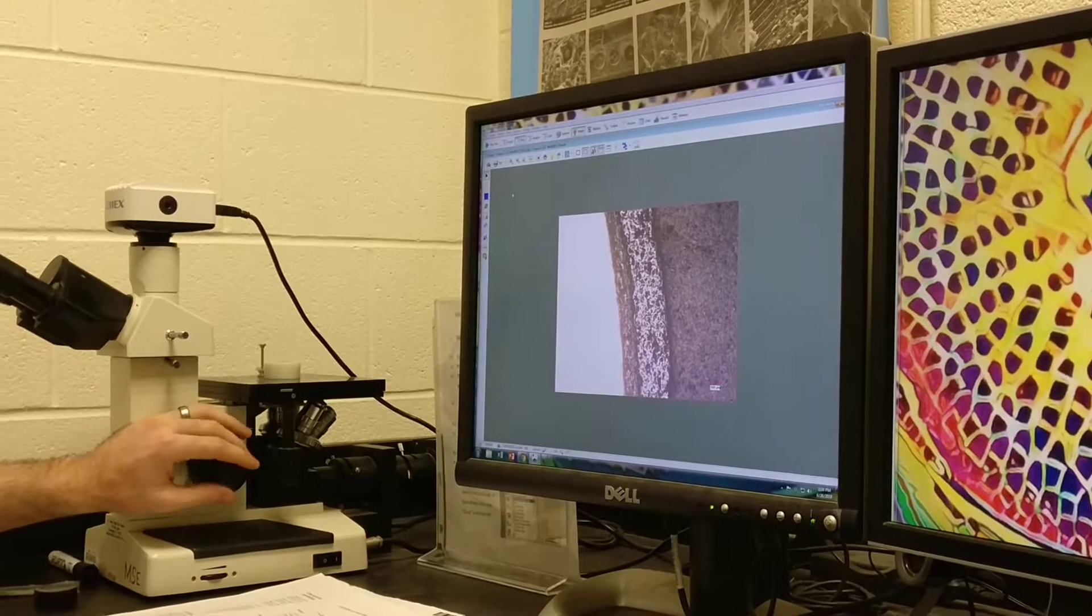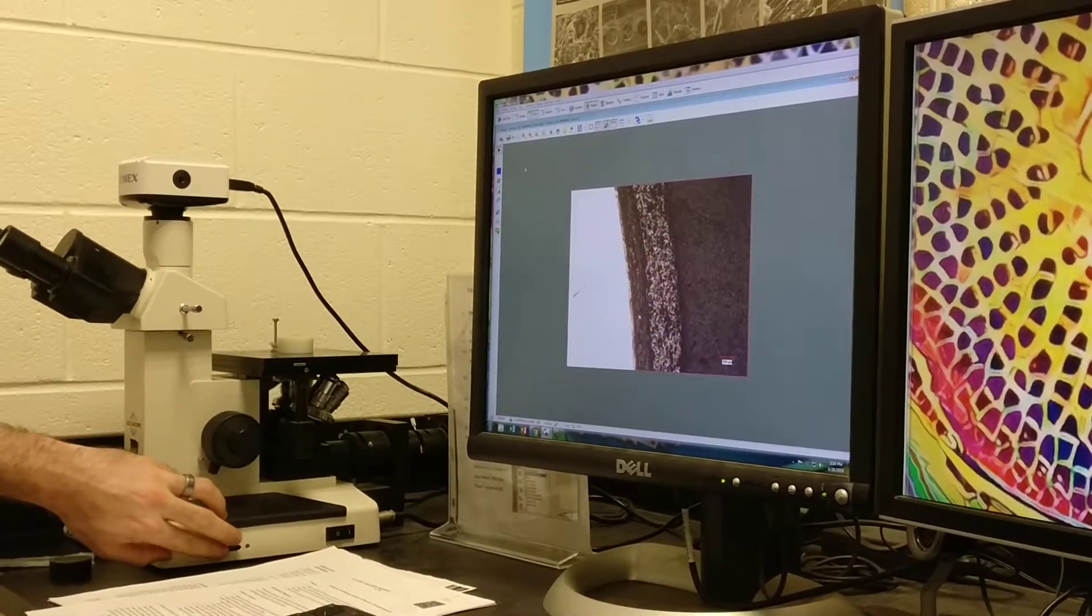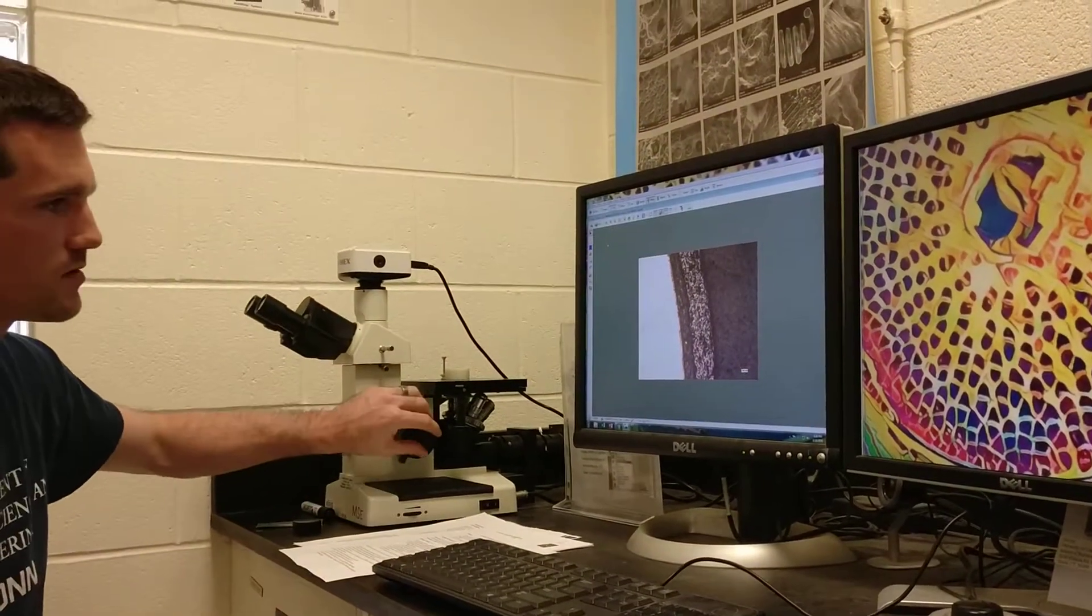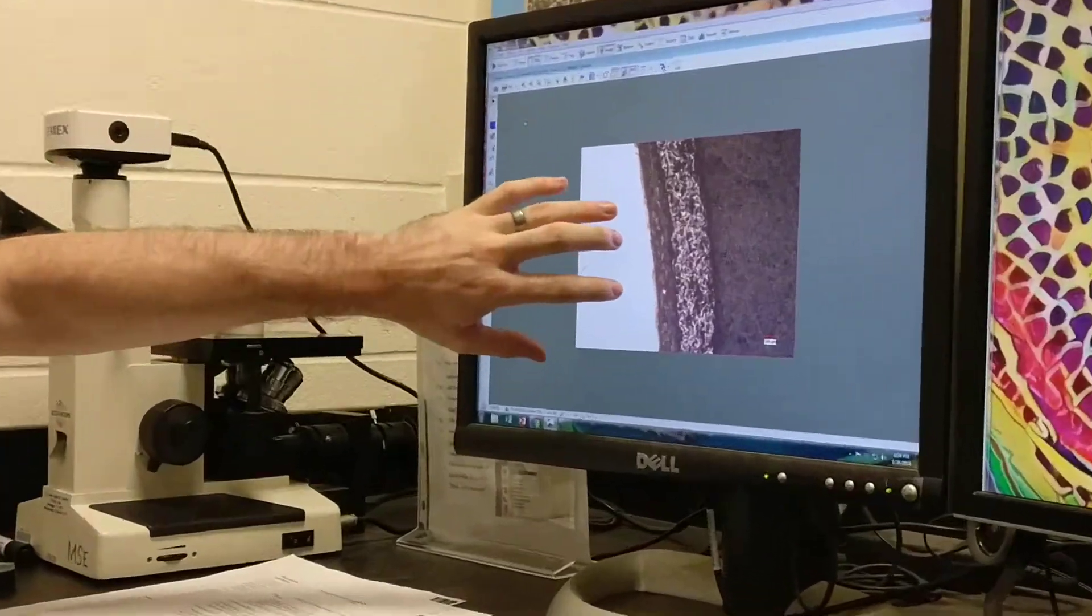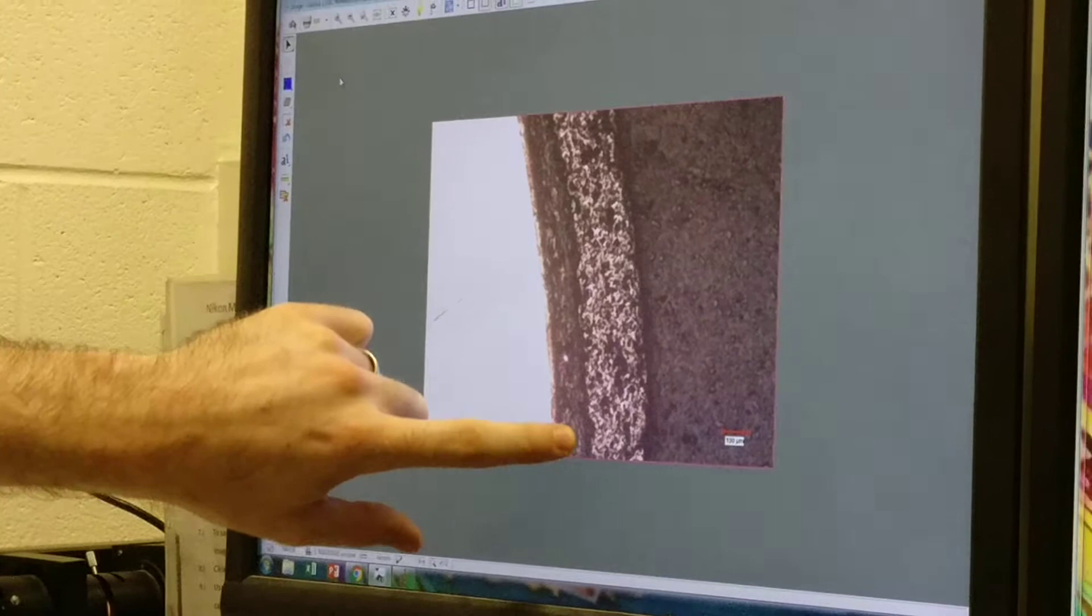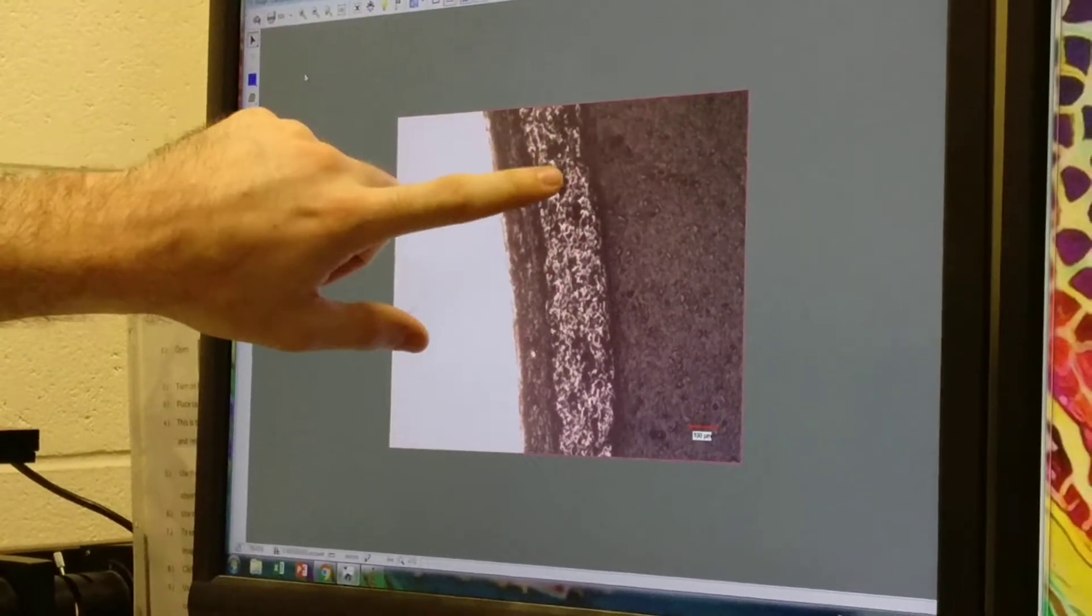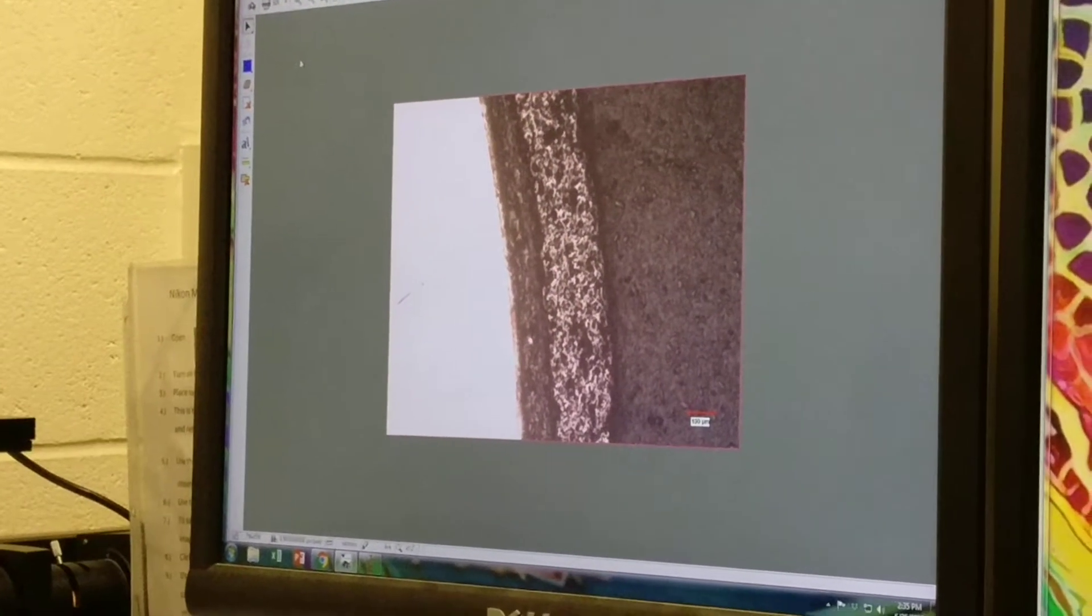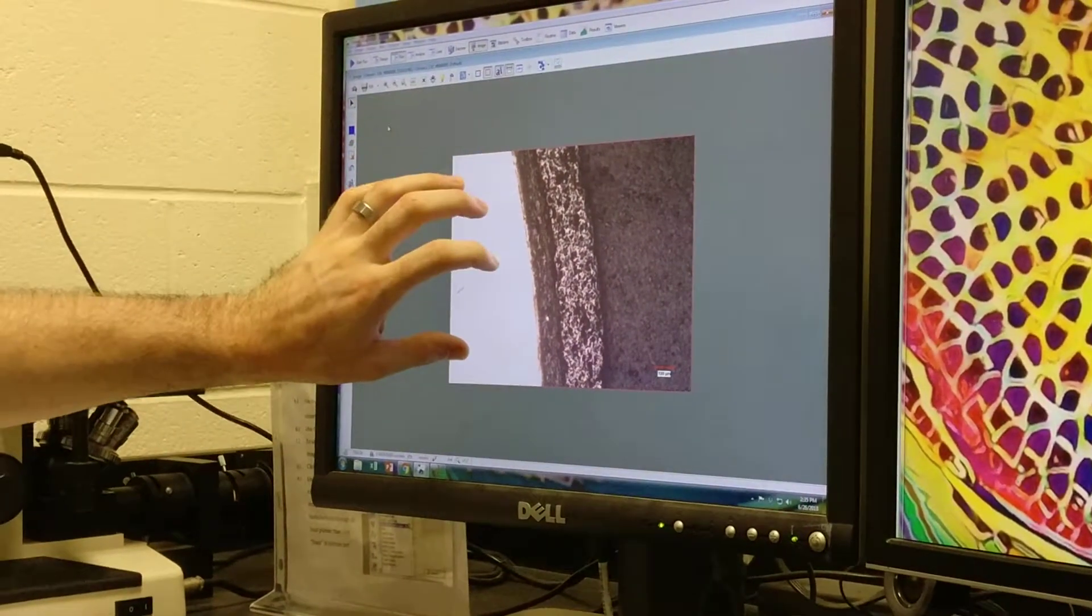We're going to notice something here which is that our thermal barrier coating actually consists of two layers, actually several layers but two main components. These are the substrate or the superalloy, we have an initial coat here which is called a metallic bond coat or MBC, then there's the thermal barrier coating or TBC.